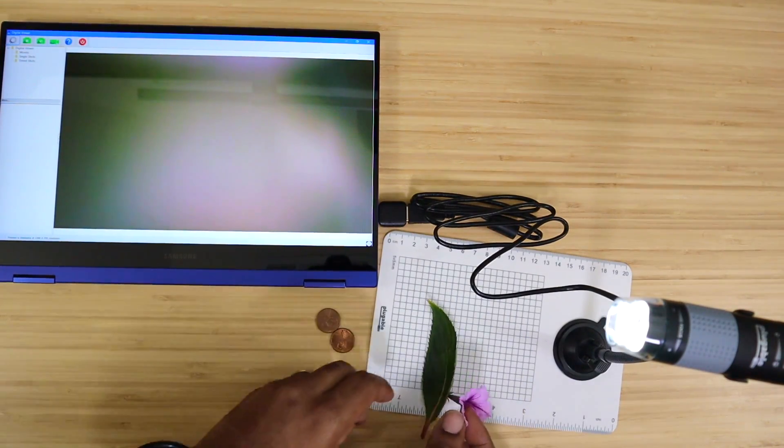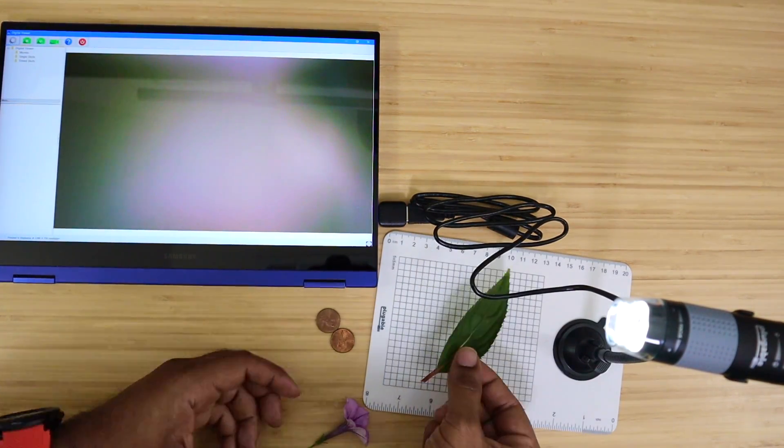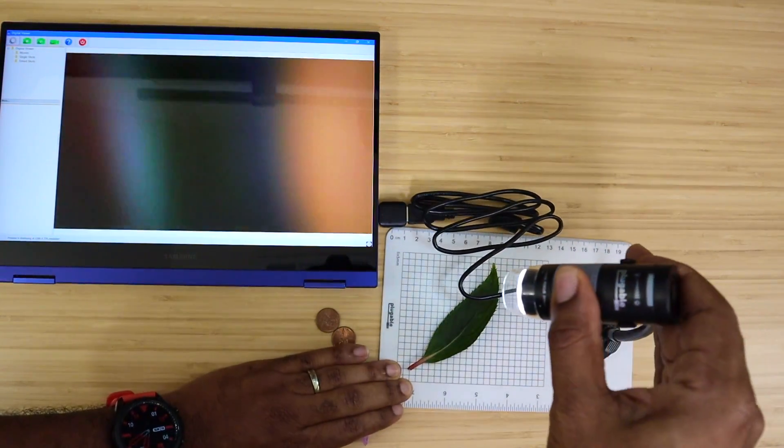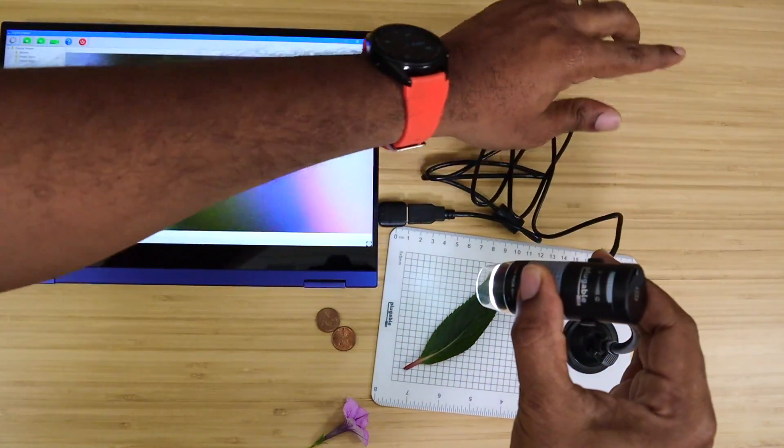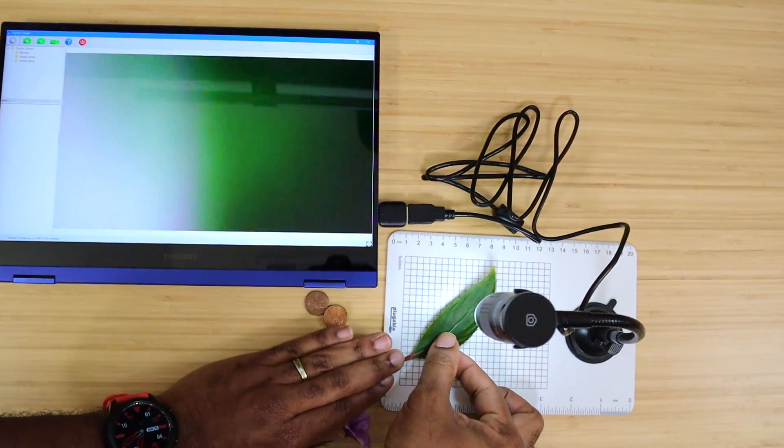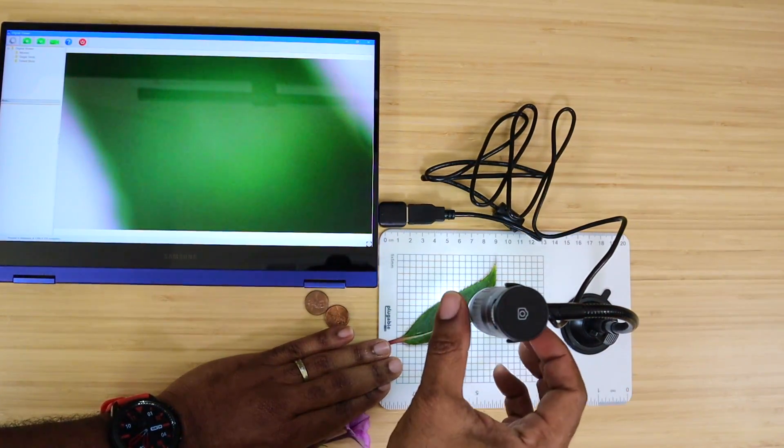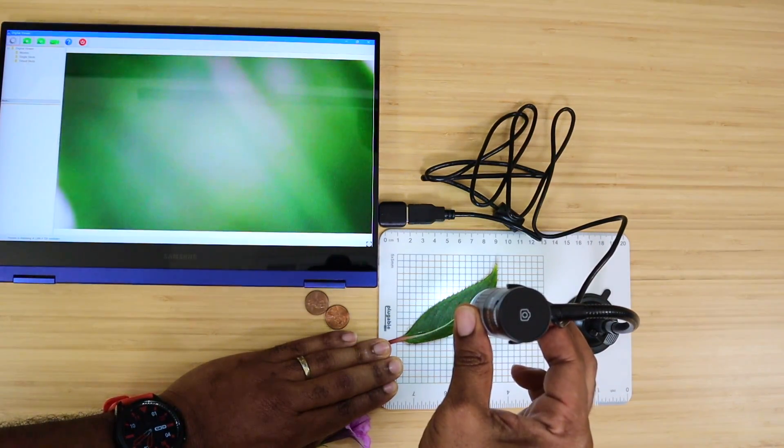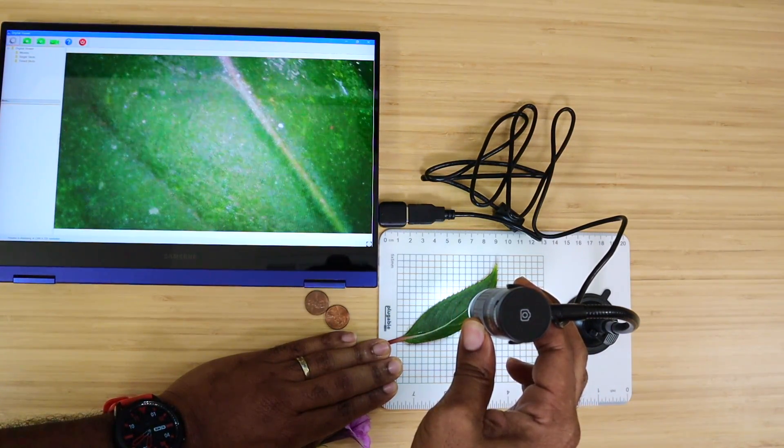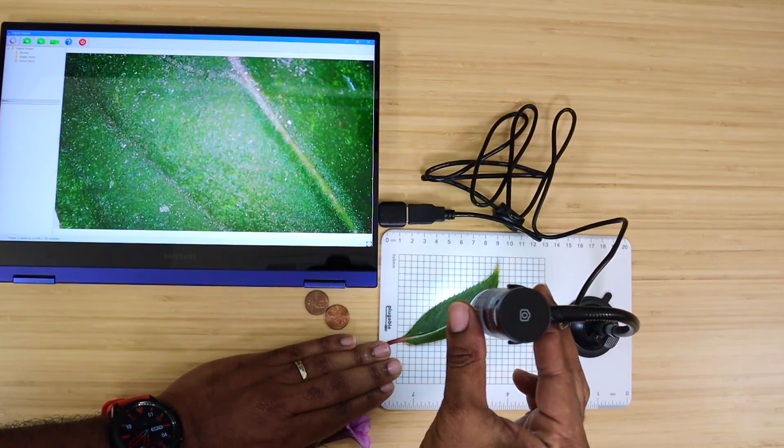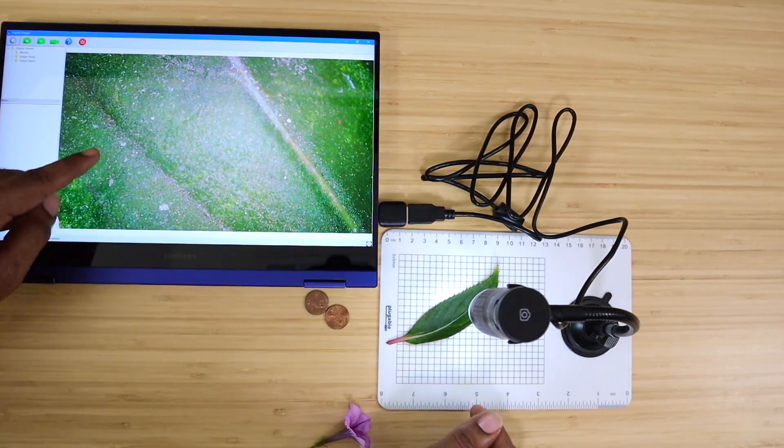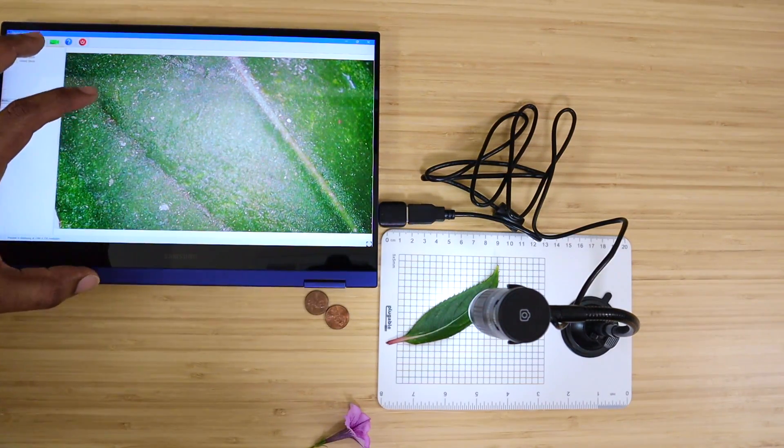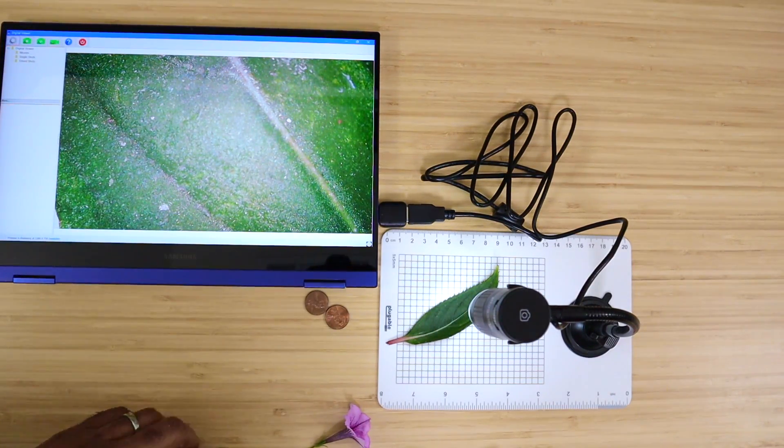I got a leaf over here. I'm going to bend this over and let's see what we can see. First things first, you're going to have to focus in on your subject. Let's get it focused and there we go. So on the leaf you can actually see all the little granules and everything. It's a perfect microscope.